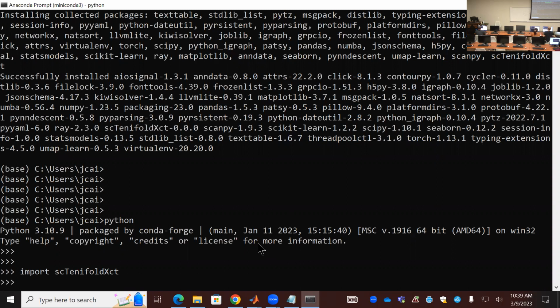I believe for your real data analysis, it's worth it, because single cell communication is a big deal for getting something out of your real data set. That's something we cannot do with traditional bulk RNA-seq. So it's adding value to this analysis, and that's why we spend some time to set this up.